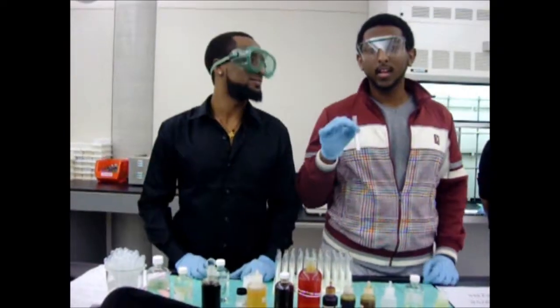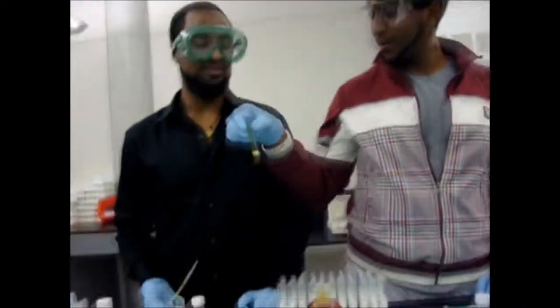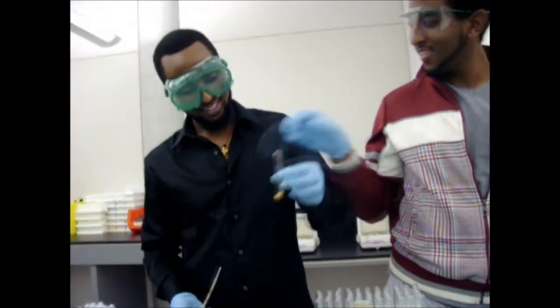So now we have our lidocaine, and we're about to dilute our bromine saturated with water. Like stir. See that, partner?